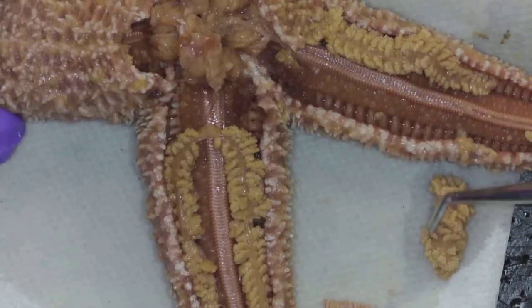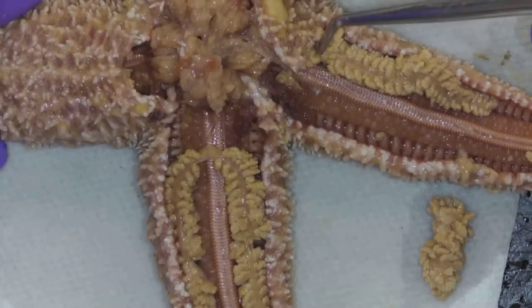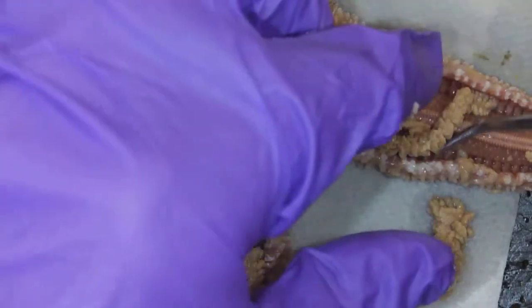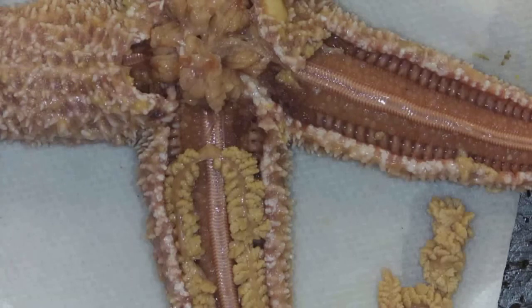So that's just digestive gland. And maybe I'll remove this one as well, just so I can get a little bit more visual of what's going on underneath. That's why I like doing two arms — now I can see one with and one without the digestive gland.